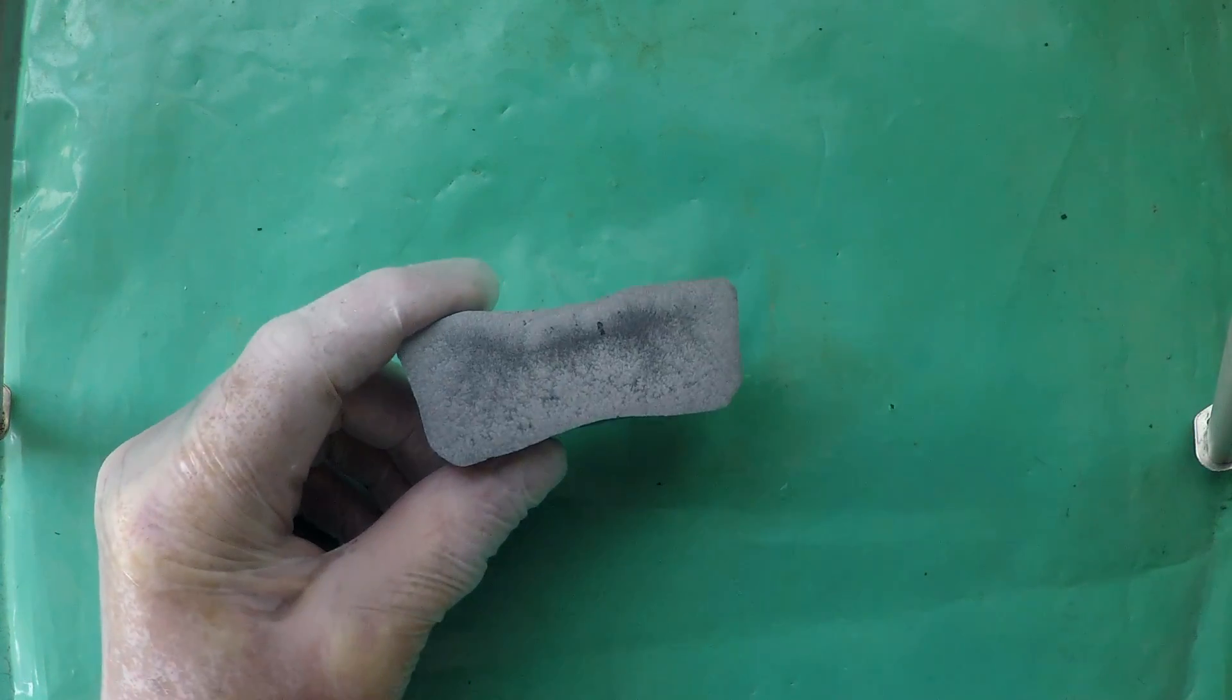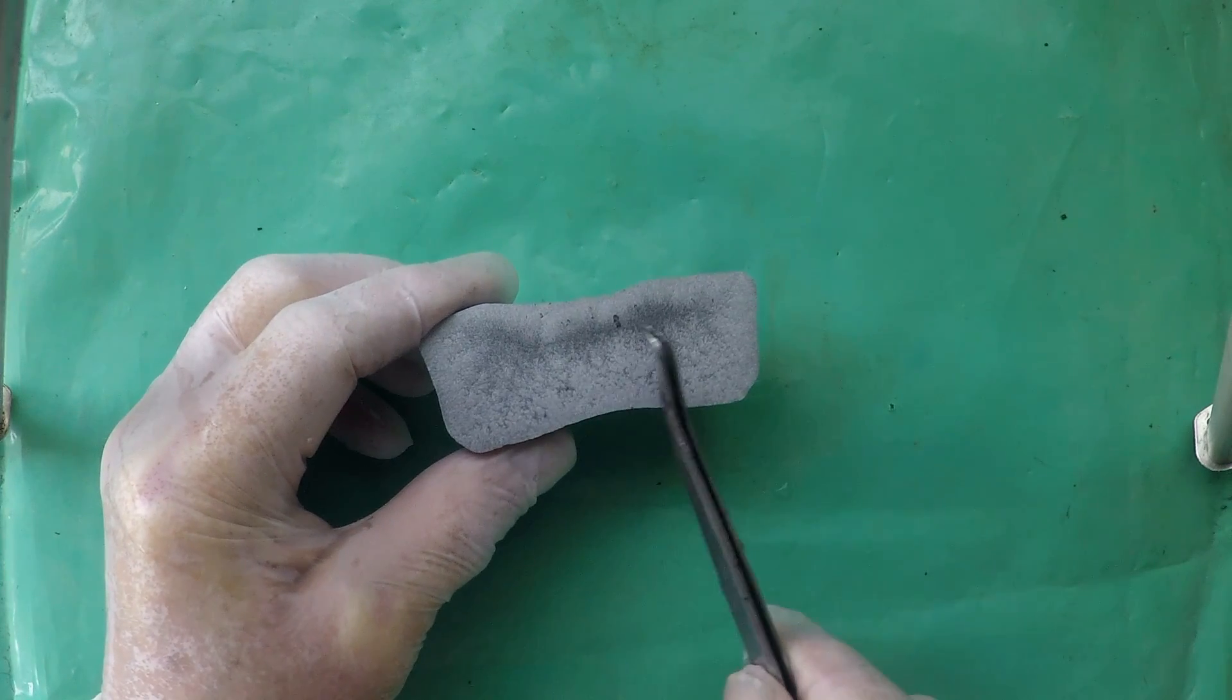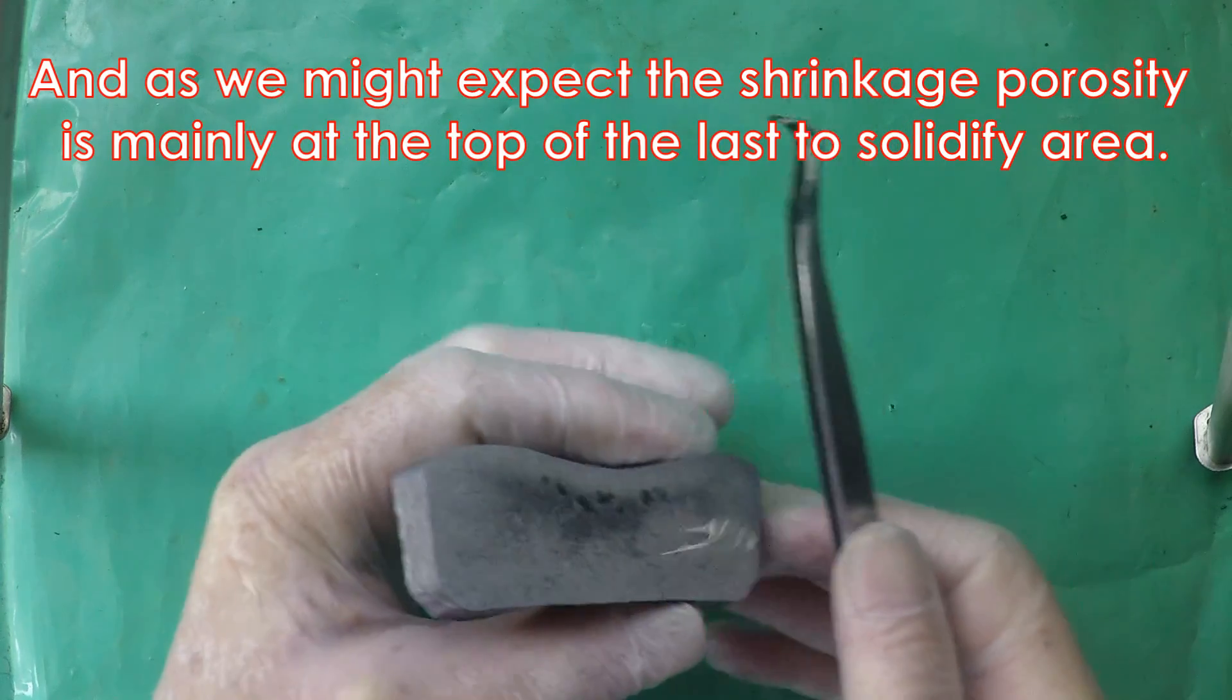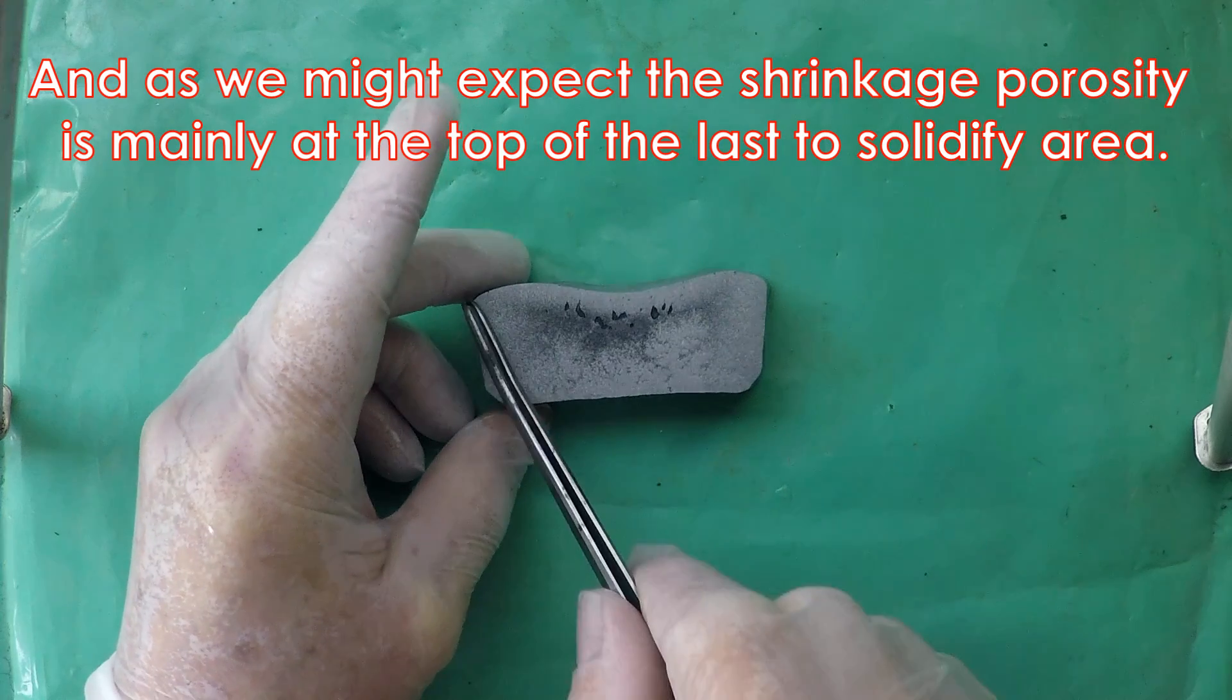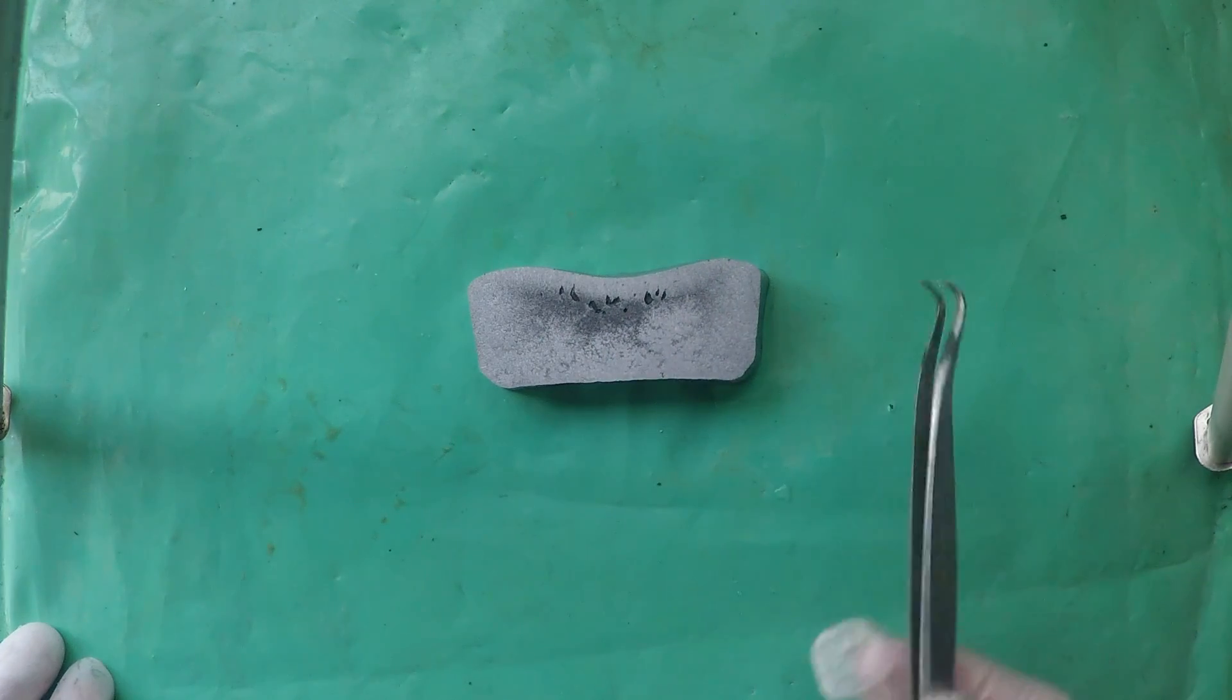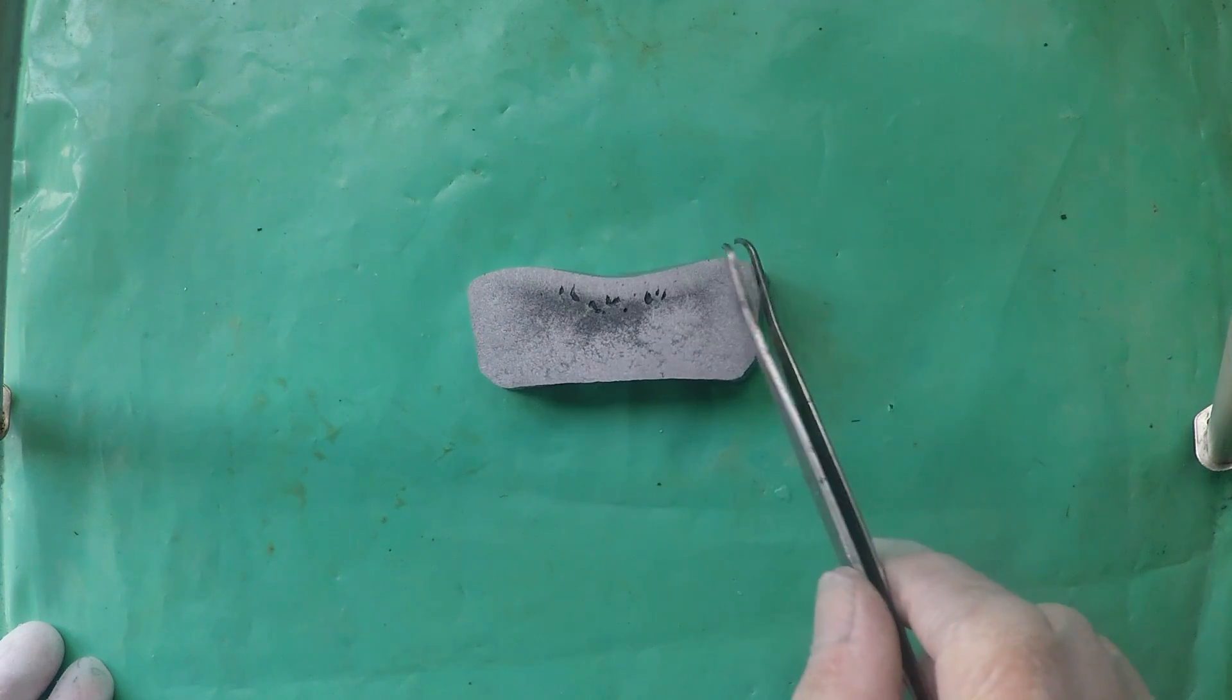And here we have our etched caustic soda etched aluminium sample. The grey area, oh the spray's still in the air, that grey area is probably where it solidified last. And this would be typical because it would solidify quickly here against the steel mould that I cast it into. But the mould was a bit hot.